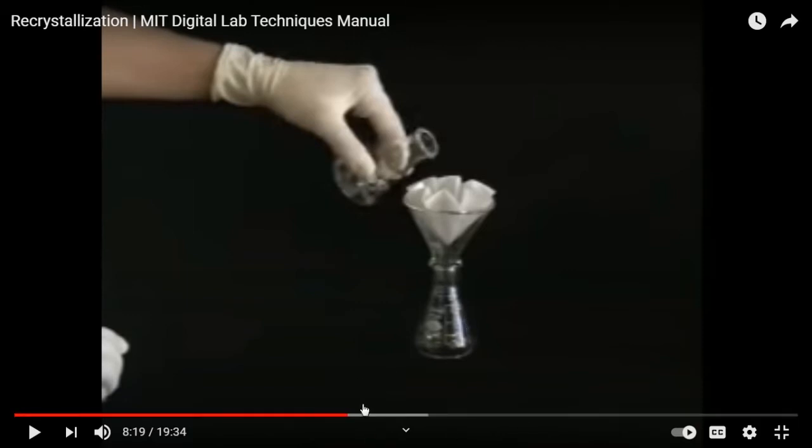You have a hot filtration with a hot plate underneath. You are gently warming, boiling this liquid, rising and rising hot vapors, warming up this funnel. That way you keep the whole setup hot.